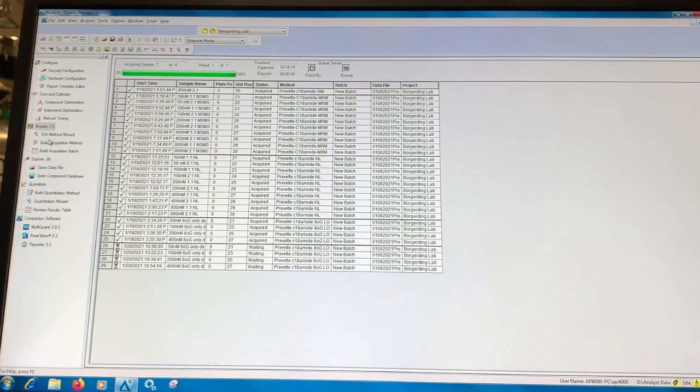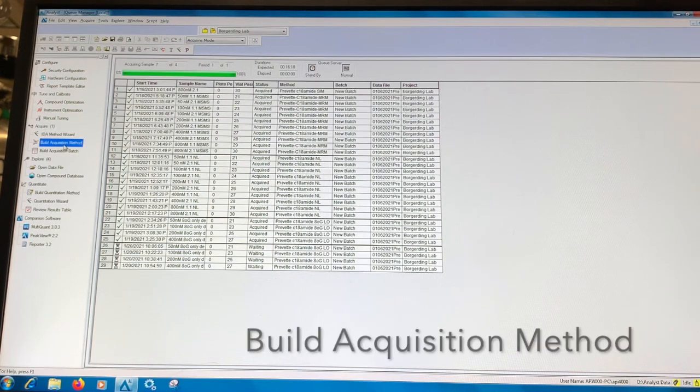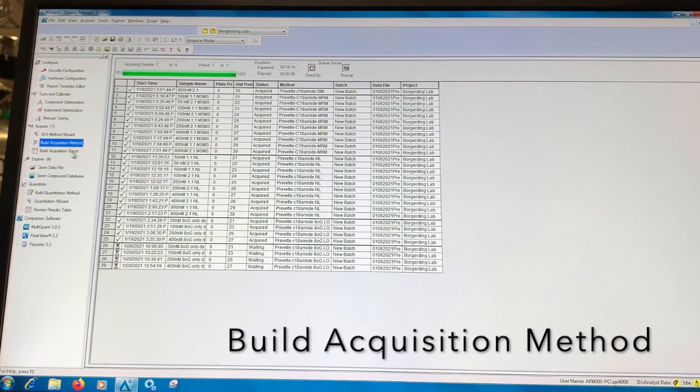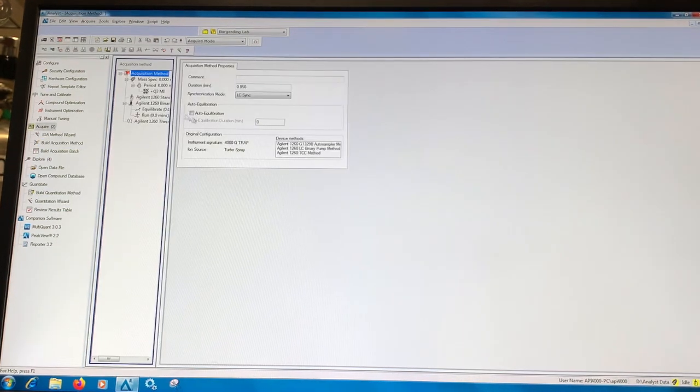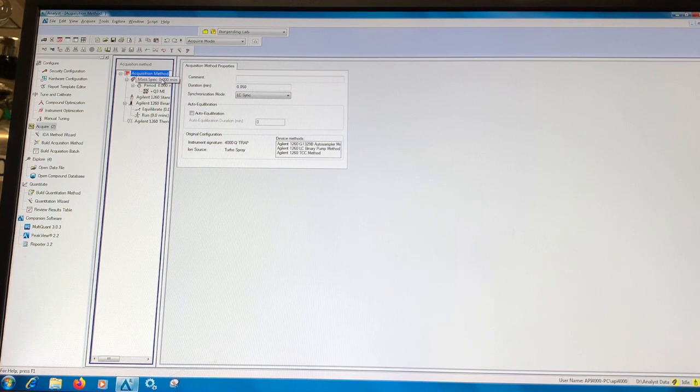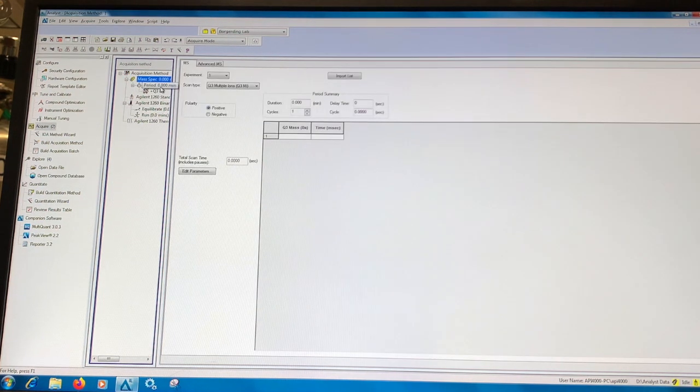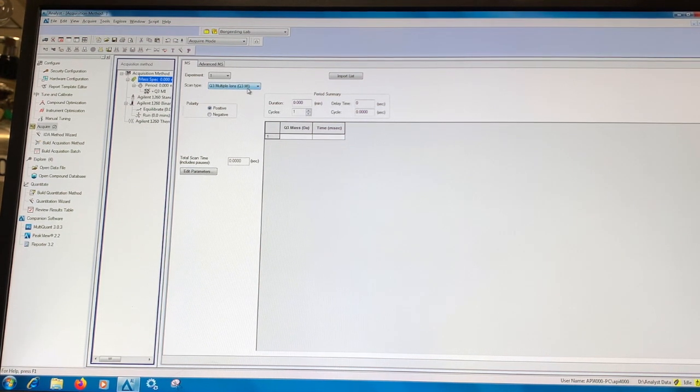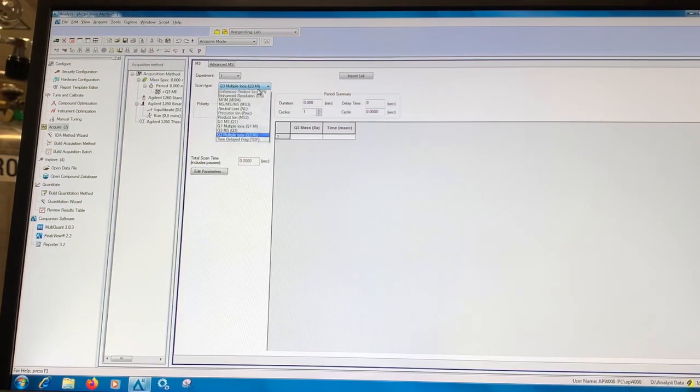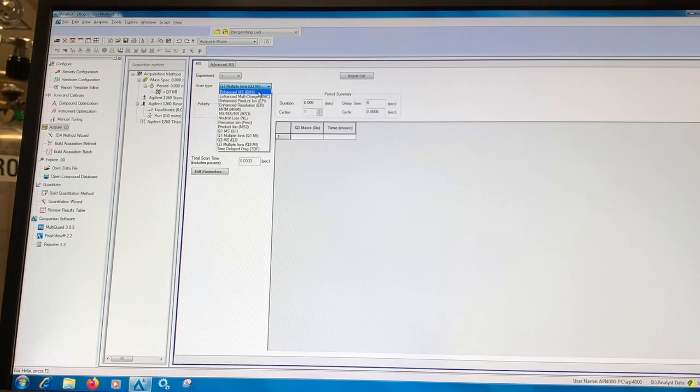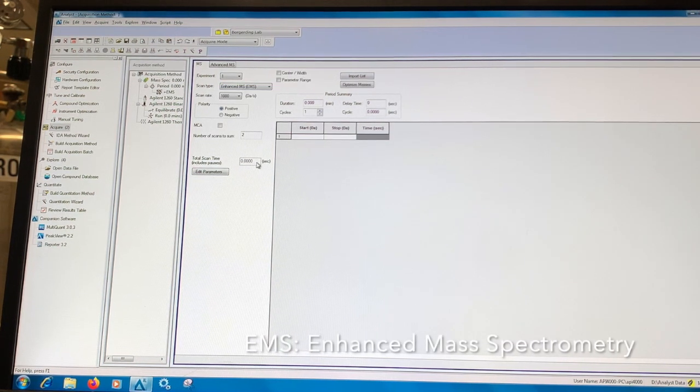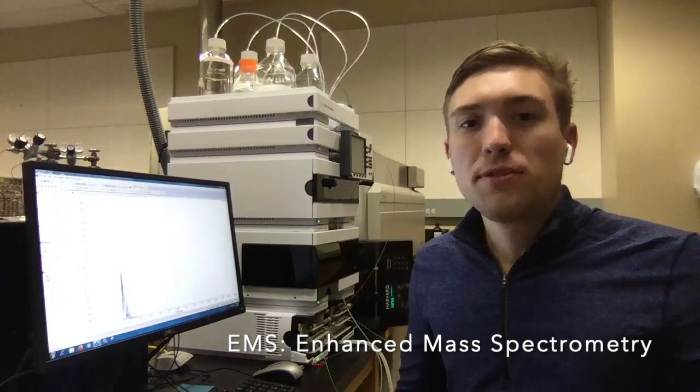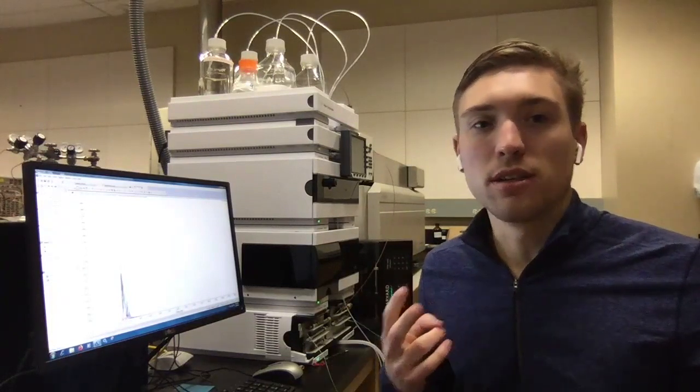I'm going to walk you through how to set up your own method. So first, we'll click on Build Acquisition Method on the left side of the screen. And that will bring us to a screen where we have to set up our first method here. Now, the first decision we have to make is what scan type would we like? And let's set up an EMS scan type. There are different methods in the mass spectrometer that can determine both what your output is in terms of signal as well as the sensitivity and selectivity of the instrument.